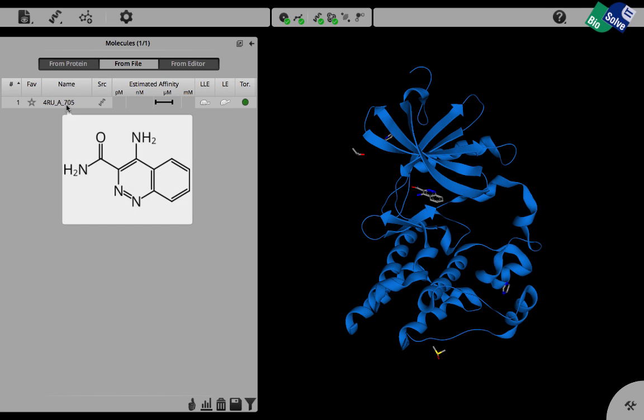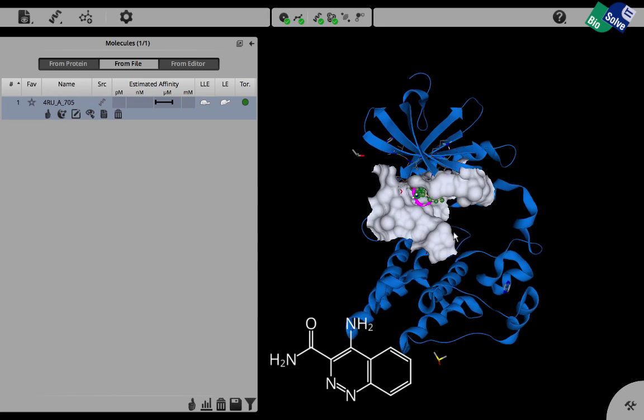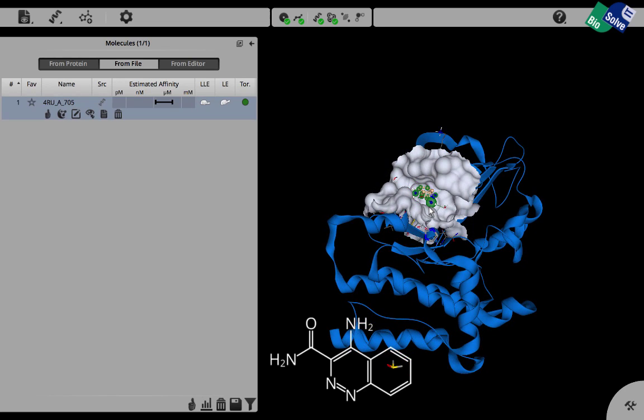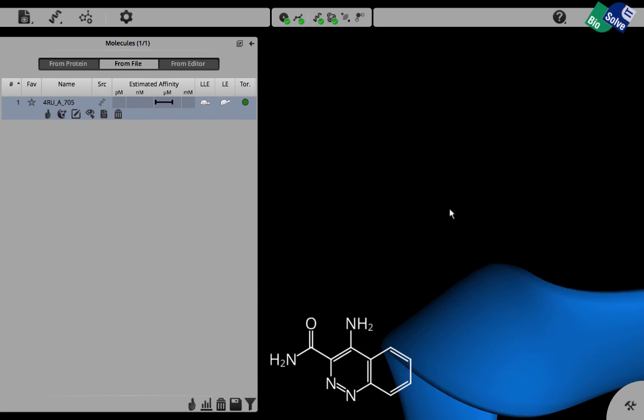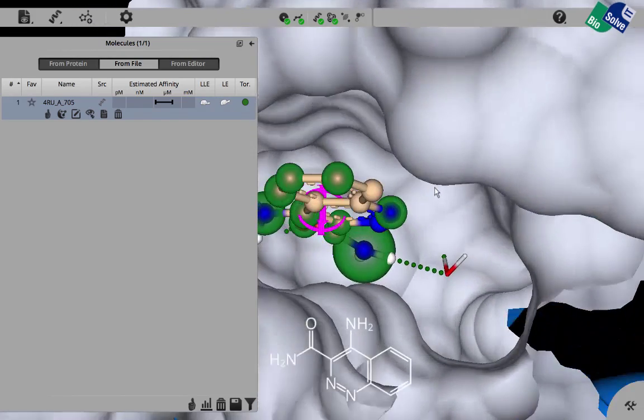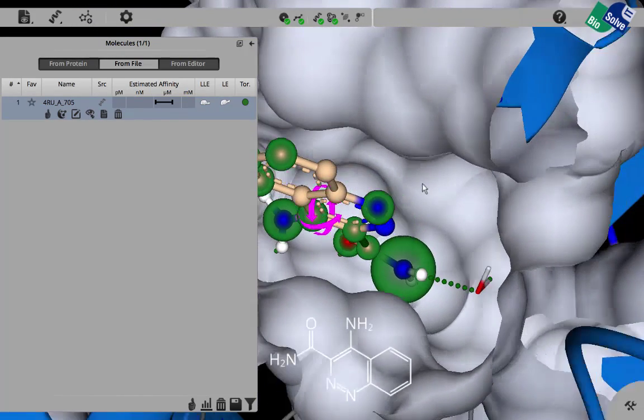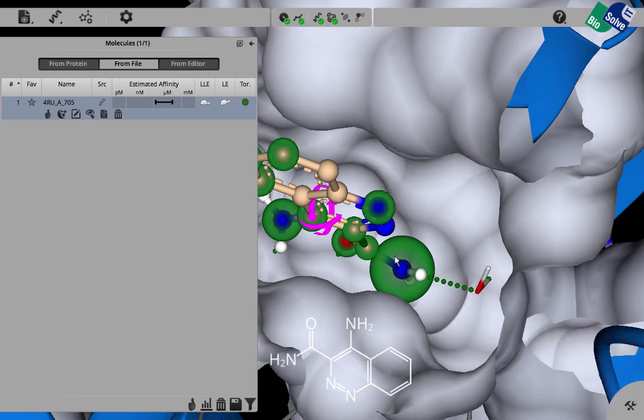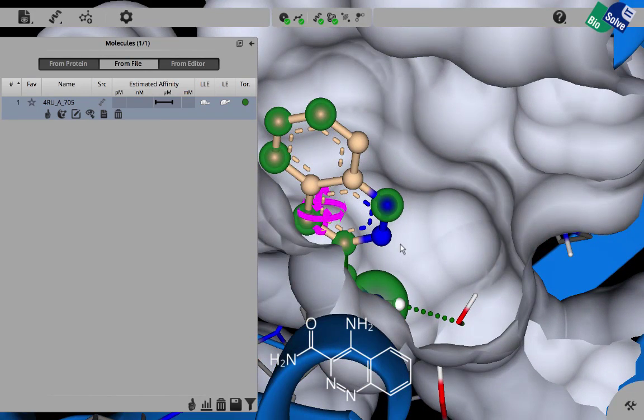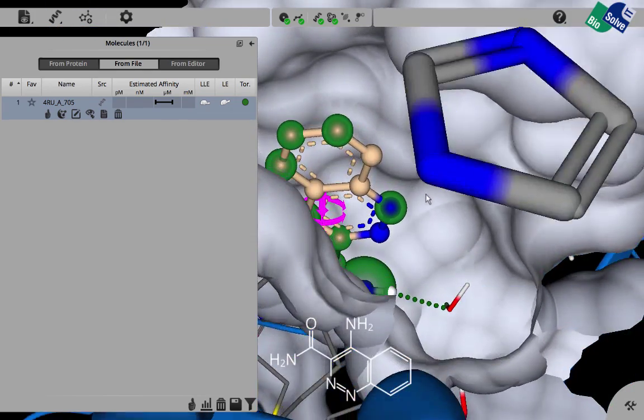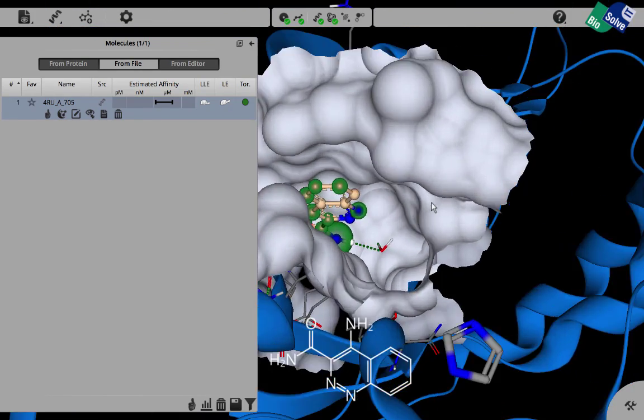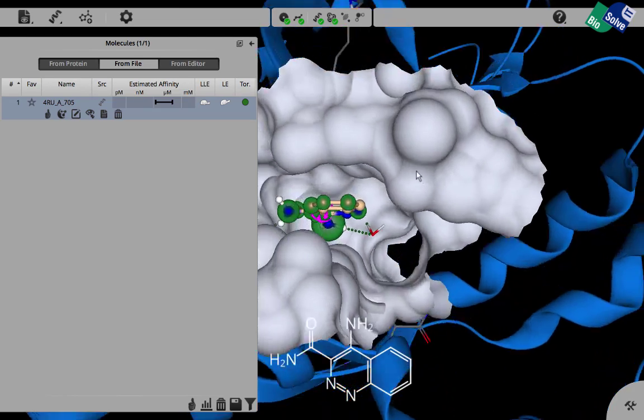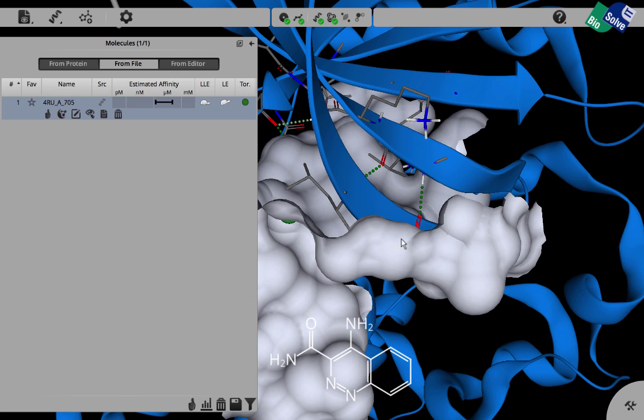Now when we click on this we get a more detailed view of this fragment hit. We can see here how it's binding against the hinge region and we can also see how the pocket here can be used to grow this fragment off this vector and use this pocket for the additions to the fragment. When we zoom out a little bit we can see the p-loop as well of the cartoon view here.